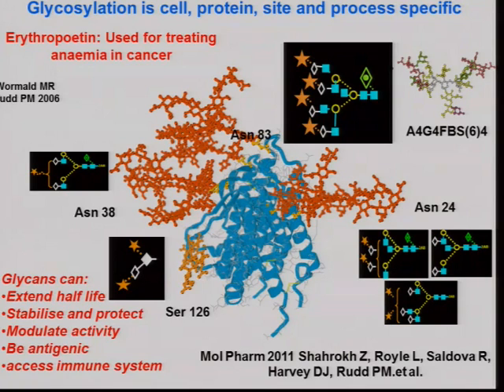And the last one. I've seen papers on glycoengineering where they show sialylated glycans or IgGs or digalactosylated glycans, but the major structures are G0, G1, G2. Why don't we have high G2? Oh, well, it's because of the structure of IgG.